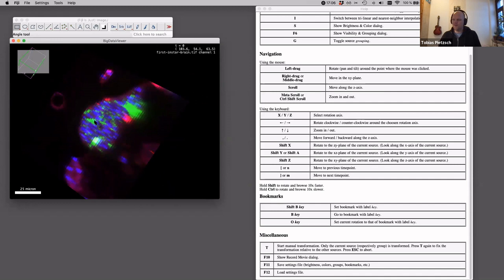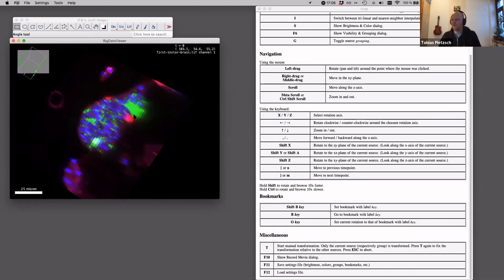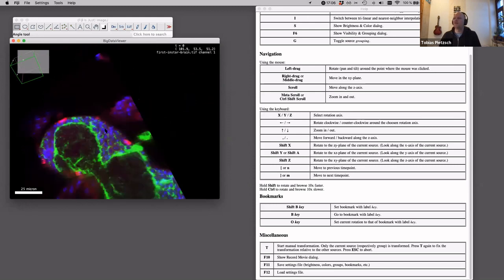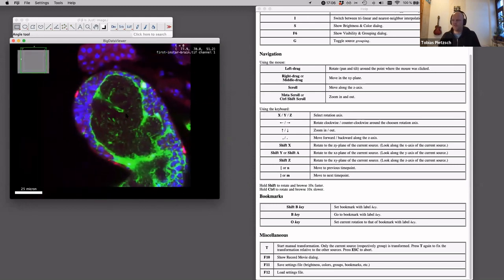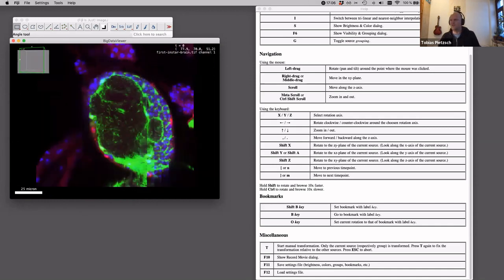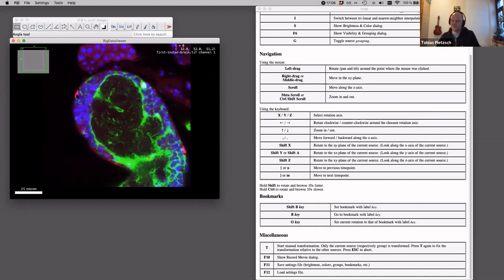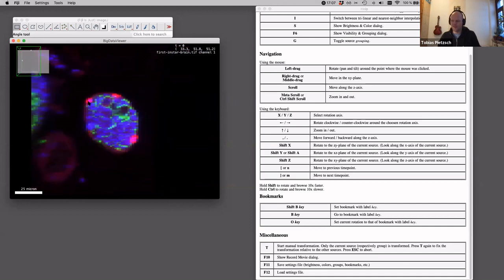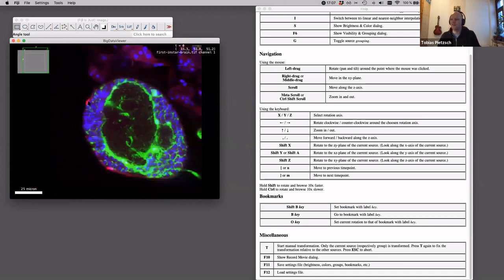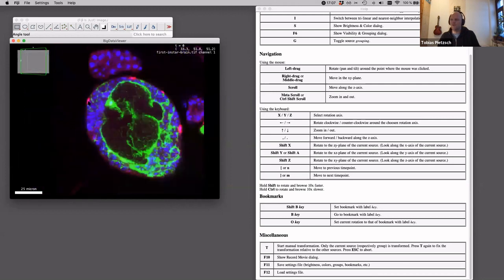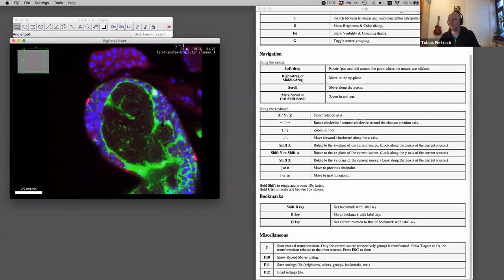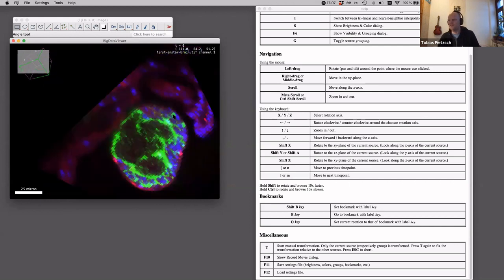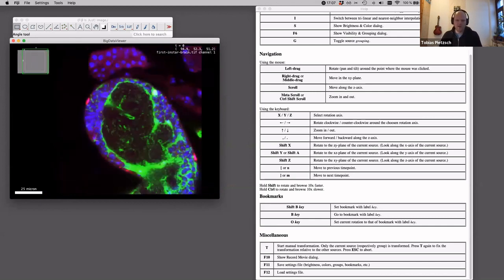Very useful keyboard shortcuts are Shift+X, Shift+Y, and Shift+Z, which orient the view along the respective axis — Shift+Z gives a frontal view, Shift+X gives a side view. Importantly, this rotation always happens around the position where your mouse pointer is, so if you place the pointer on a structure of interest and press Shift+X or Shift+Z, that structure stays centered under the mouse pointer.